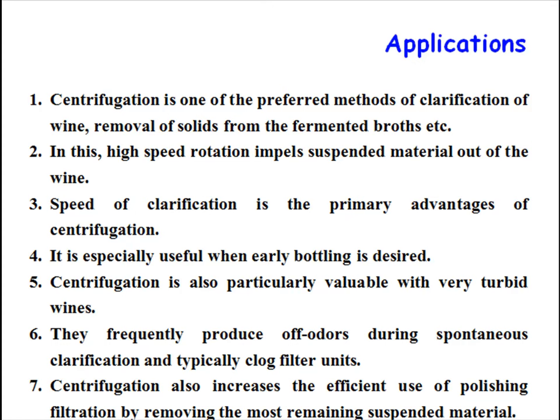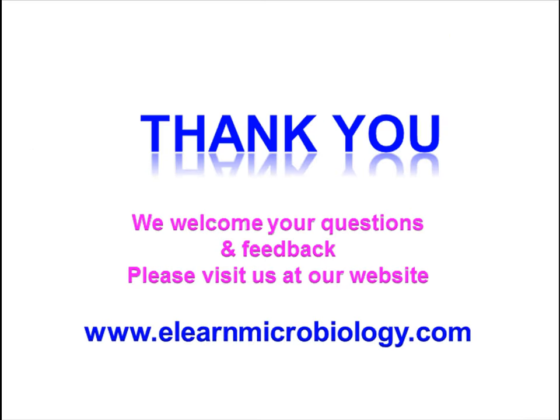Centrifugation is also particularly valuable with very turbid wines. They frequently produce off odors during spontaneous clarification and typically clog filter units. Centrifugation also increases the efficient use of polishing filtration by removing most of the remaining suspended materials. So by that we have completed discussion of centrifugation and filtration.